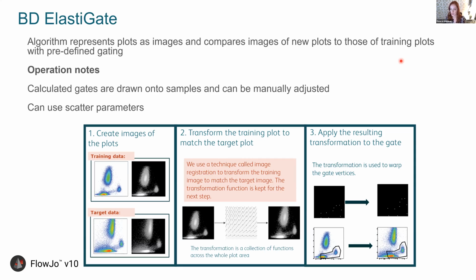Gina, that's a good question. I will get to that. But the short answer is no, you don't. There will be a setting to try to circumvent that. But you could, in theory, do separate trainings if you wanted to. But we do have a toggle in the tool to address maybe differences in population distribution because of a biological condition like you described, like unstimulated and stimulated.